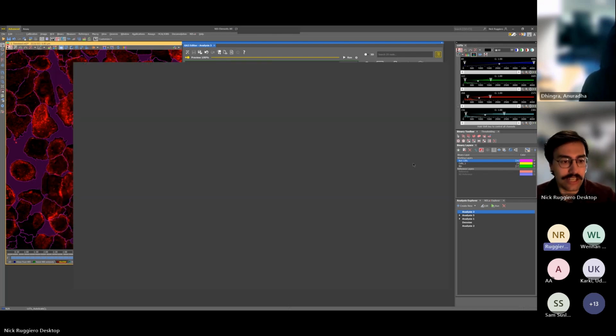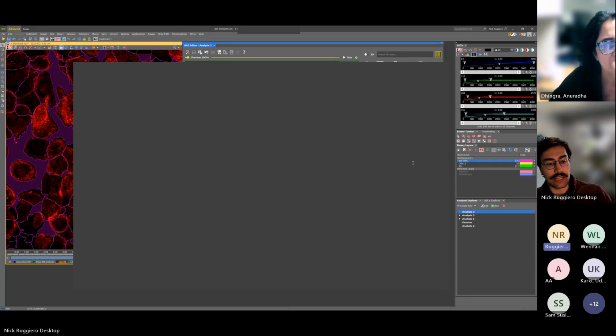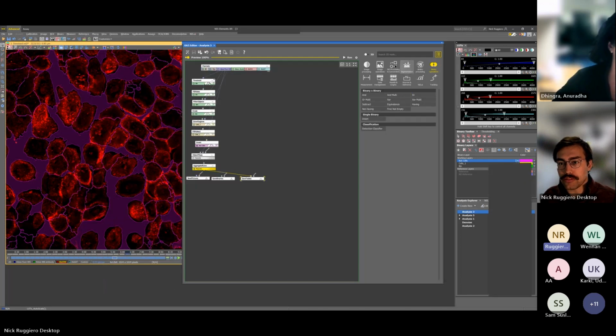Okay, perfect. All right. So if nobody else has any questions, we can probably end it there. If you guys start messing around, we have another question. In the case of we need distance measurement between cells, we may want to use the green channel as it's the marker cell lines. Yes, there is a way to do distance measurements.